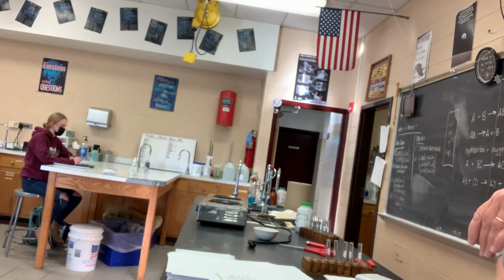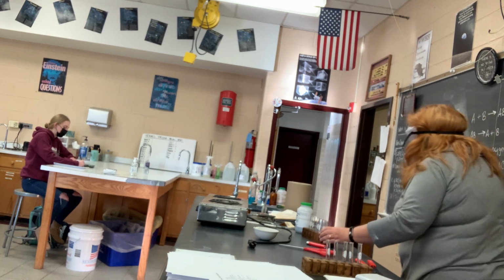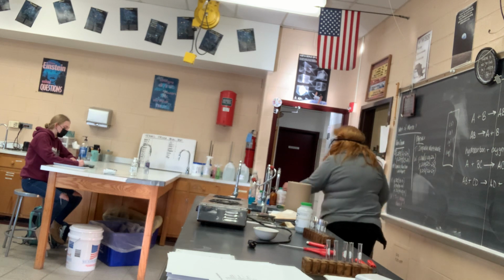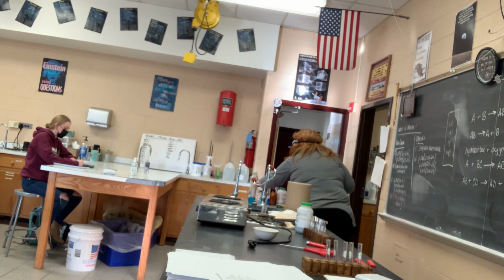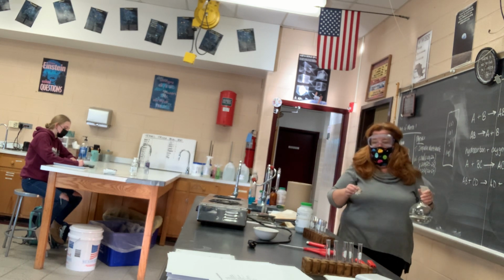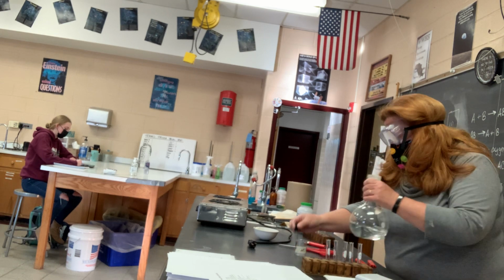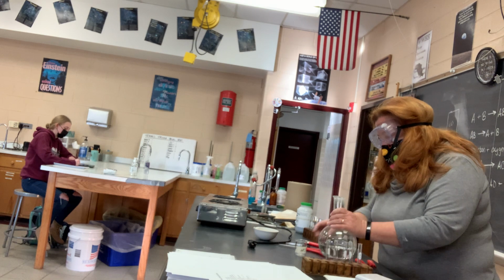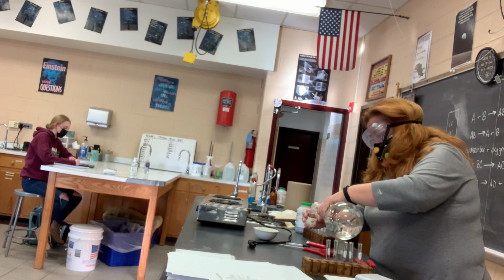That's a little better. Okay, clean, dry test tube in the test tube rack. Add 1 pipette full of hydrochloric acid. Okey-dokey. Got my beaker, my eyedropper, my Florence flask. This is 6 molar hydrochloric acid. You'll understand what that means eventually.